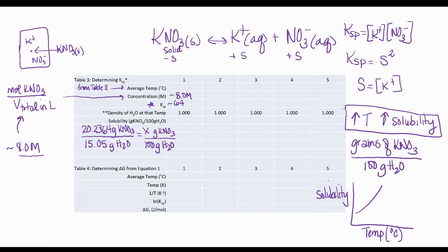The other thing that it will ask you in your lab manual handout is that once you've generated that graph, and you're going to make it look nice with its units, its axis, its titles, all on one nice page, a very professional graph, then it's going to ask you to compare it to the known graph for potassium nitrate. I'll give you a hint that it is found in your textbook in chapter 11. Or you could also look it up on the internet, because the solubility versus temperature of salts is a very common graph, very easy to find.